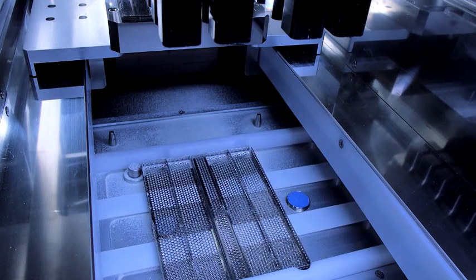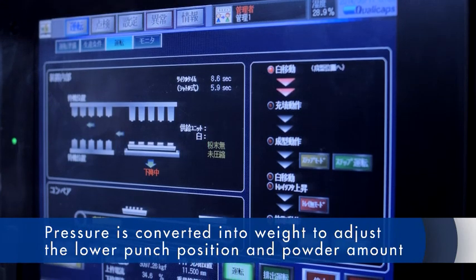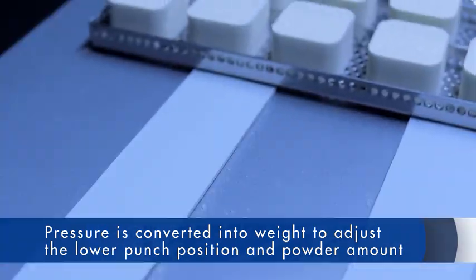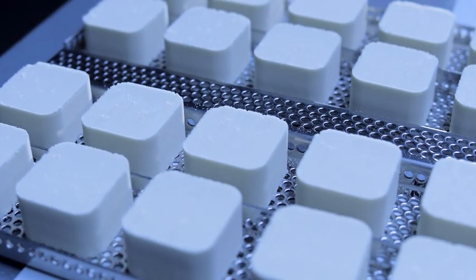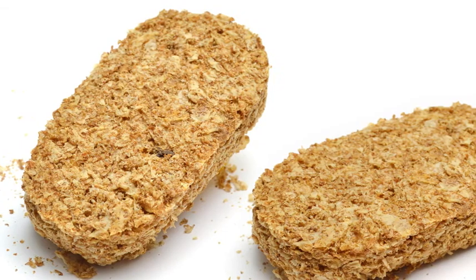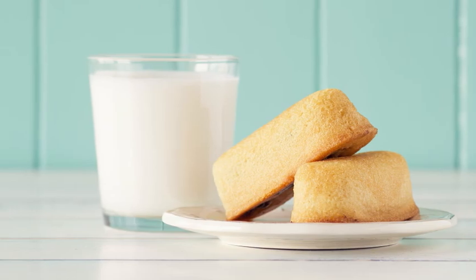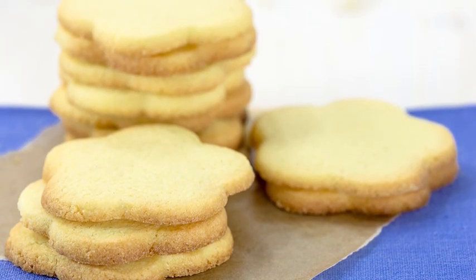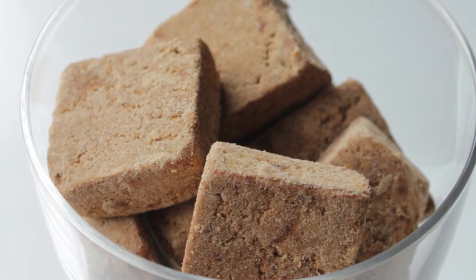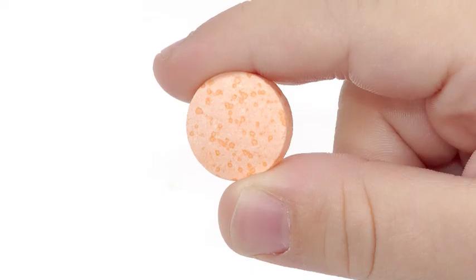This system differs greatly from conventional tableting machines. Pressure is converted into weight during compression to adjust the position of the lower punch and the amount of powder to be added. The HPTM EX can gently harden powder into a variety of shapes without the addition of additives or disintegrators, while successfully producing moldings that are extremely quick to dissolve. The HPTM EX is capable of molding a diverse range of powders, including orally disintegrating tablets and other products not easily handled by conventional tableting machines.